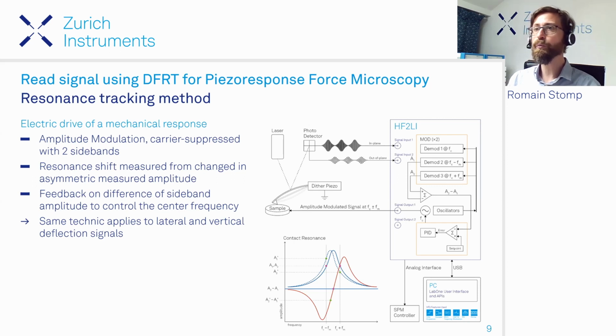So on Piezoresponse Force Microscopy. Of course, the challenge with PFM is that we cannot rely on a PLL because the phase is flipping depending on the polarization. And therefore, you cannot rely on the phase, but you have to rely on the amplitude only. And that's why you use this amplitude modulation technique.